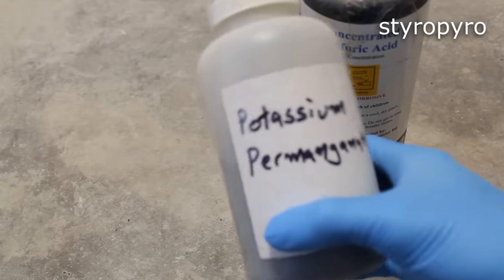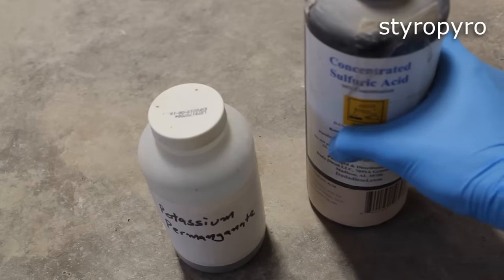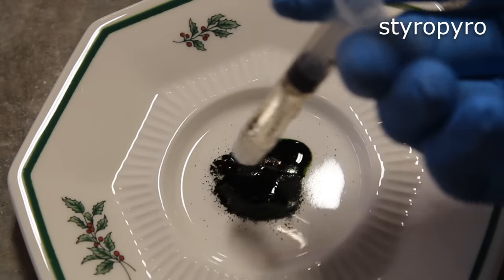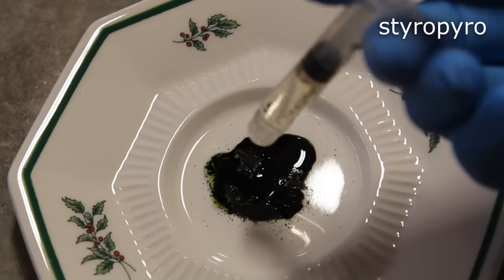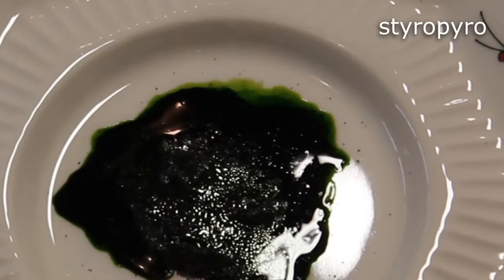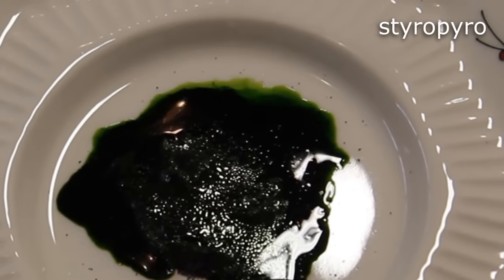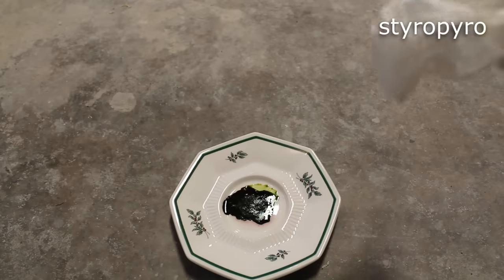Manganese heptoxide can be made by mixing potassium permanganate with concentrated sulfuric acid, which are both very reactive chemicals on their own. This chemical forms quickly at room temperature. In fact, that green color that you see there is actually that heptoxide forming. I've zoomed in a bit so you can see the green color. Manganese heptoxide is actually an oily liquid at room temperature, but what you're seeing here is technically a solution in sulfuric acid. If the heptoxide was pure, it would actually be a reddish-brown color. It's an evil compound that reacts with practically anything organic.